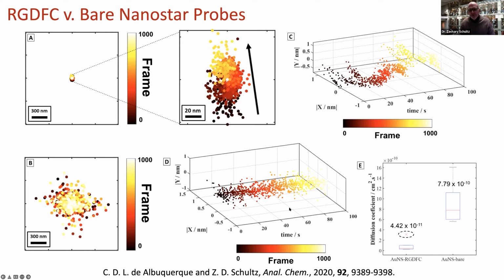And then again, without the peptide, you don't see any of this correlated oscillatory motion occurring in the cells the same way. And you can do things like measure the diffusion coefficients of the 2 probes based on these types of measurements, and you get the same kind of biophysical information you would get out of single particle tracking that has been used in other implementations to study this.